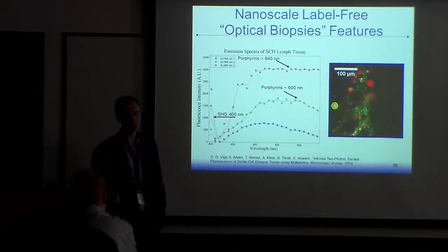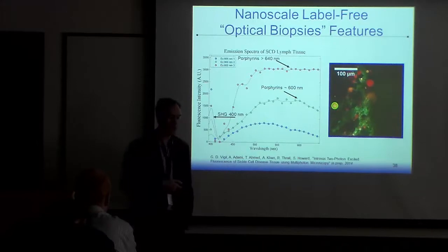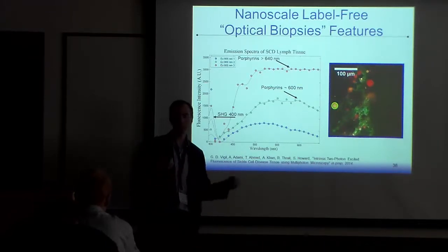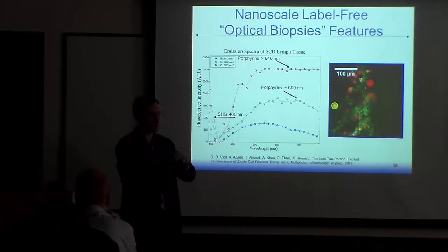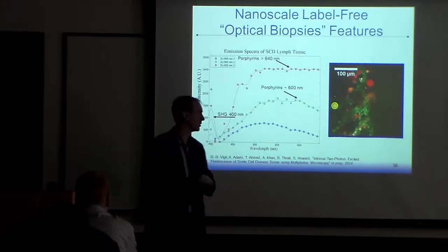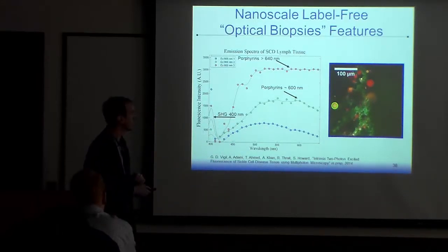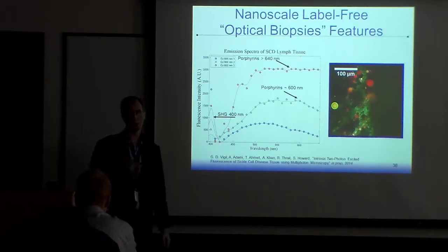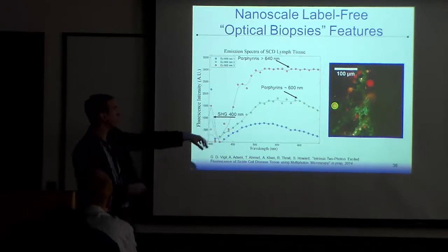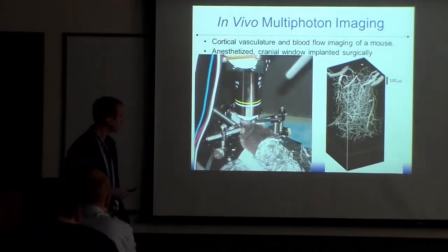We can put them through other types of techniques. We can do the sectioning and all that other stuff. And we're starting to find out that some of these are actually iron, that as the spleen is breaking down these bad red blood cells, it basically is forming these little blobs of compounds with lots of iron in them, and they're just sticking around the spleen because they're insoluble pretty much in everything else. And so we're working with medical doctors and immunologists who are really interested in these blobs of iron, and basically say, hey, we actually can see them inside of a living animal, and this is one of the things that you can do with it.